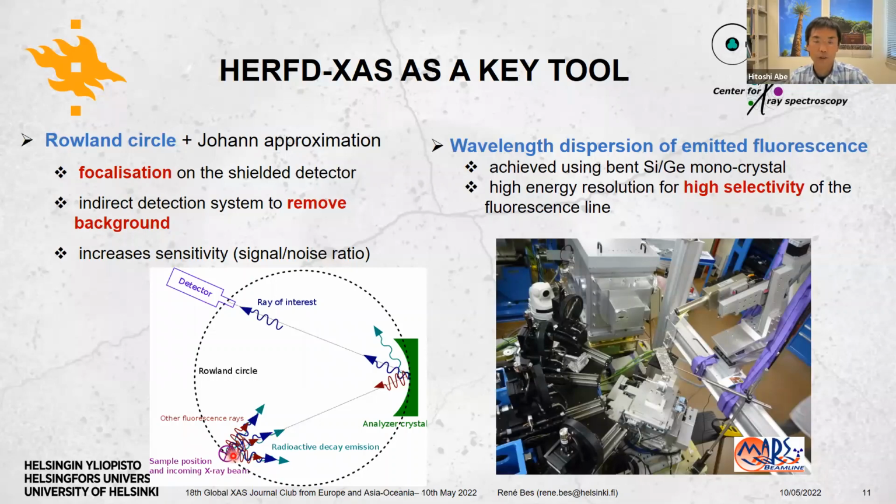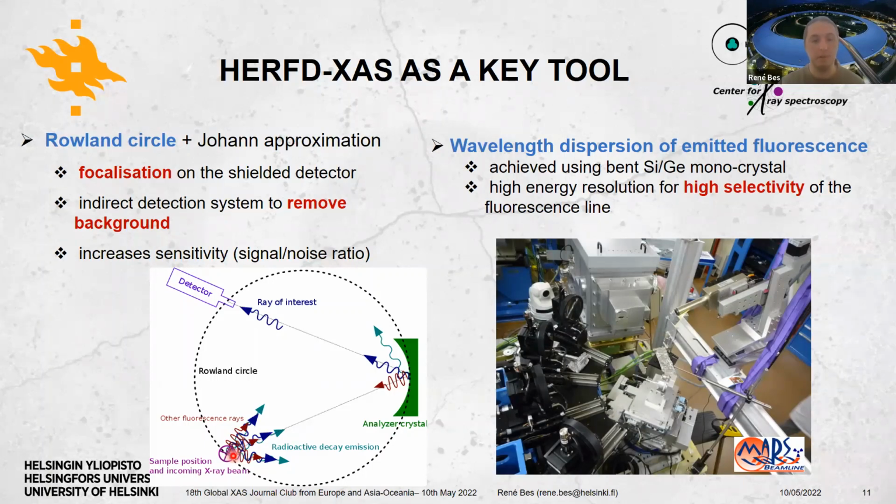Okay, so not so wrong. Yeah, the issue comes from the fluorescence yield, of course, and the solid angle you are covering with your crystals. So the more crystals you have, the better, because you are covering more and more solid angle.